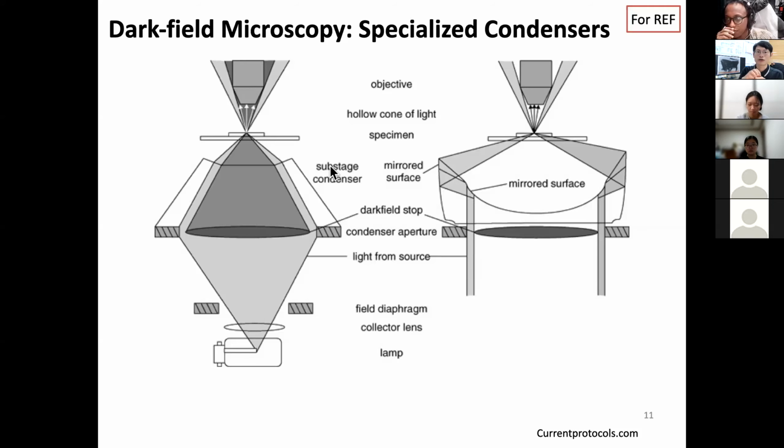But for dark field microscopy, you remove the background as dark. So it provides relatively better contrast, and it's easier when you have to analyze only the sample, let's say the size of the cell and segmenting the cells you are trying to understand. So in that regard, dark field microscopy is pretty good.